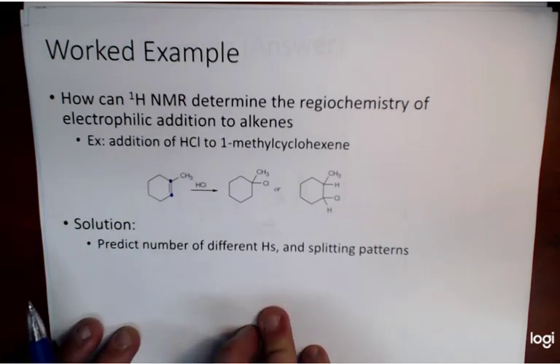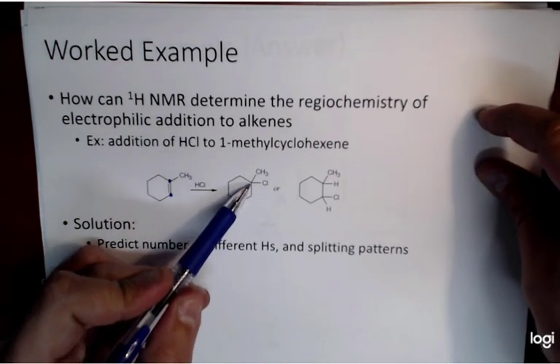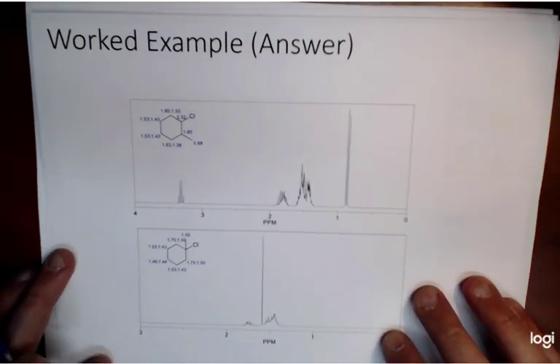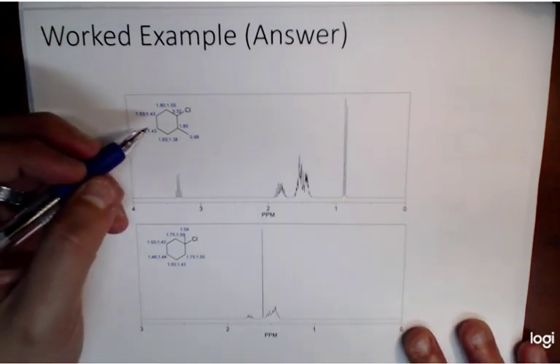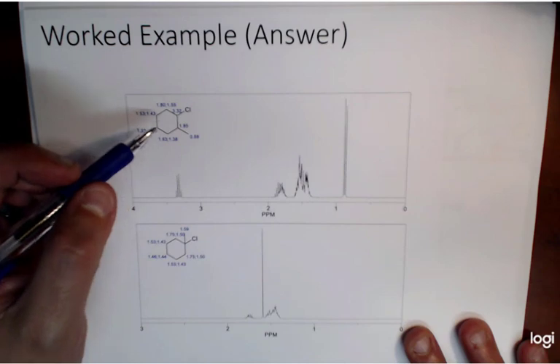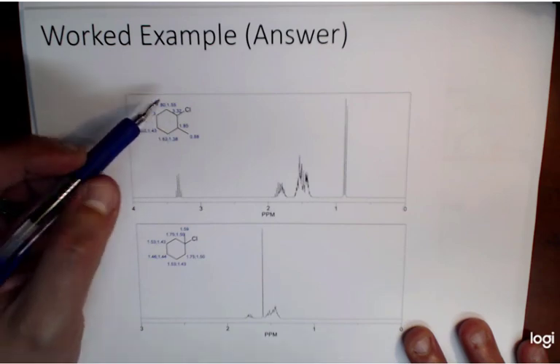Based off of our structural differences, just by the chlorine being at either this position or that position, we see two exceptionally different NMR spectra. Technically this works the same way. My apologies.